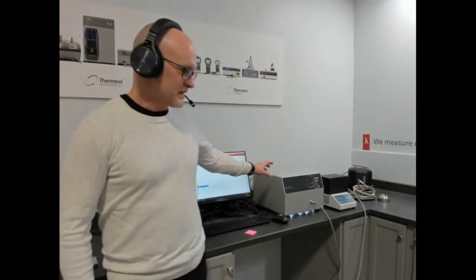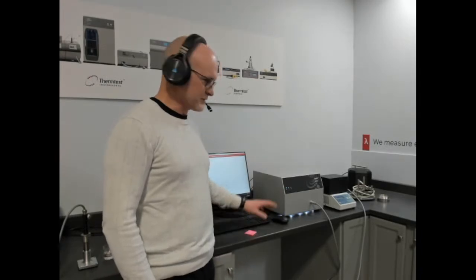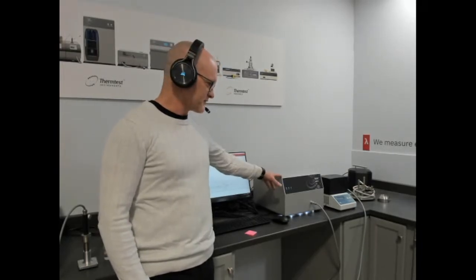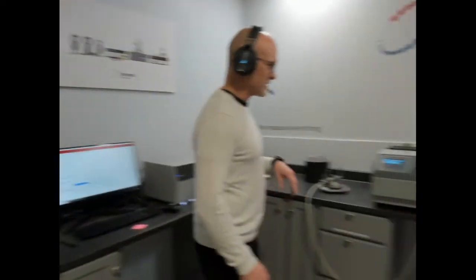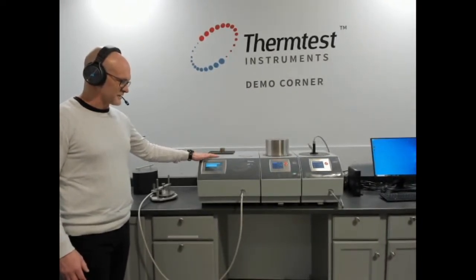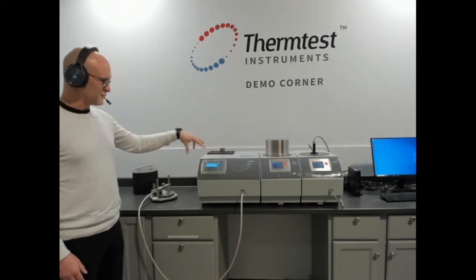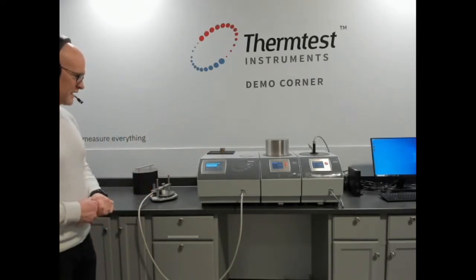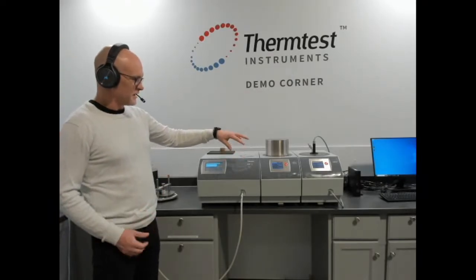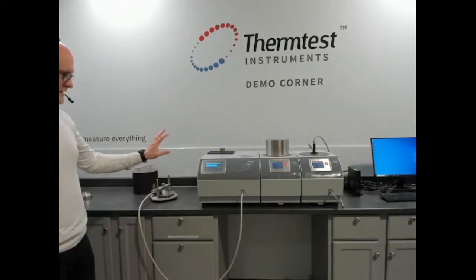Turning to my left is the new MPV, which we'll be talking more about next week. We're doing a demonstration series on that. The MPV standing for versatility, combining multiple methods for intelligent thermal conductivity. And then our marquee, the industry leader in transient versatility for measuring thermal conductivity, diffusivity, and specific heat across multiple methods. The MP1 being the highest level measurement platform we have, which combines the ability for multiple methods as well as a switch and intelligent software to connect those all together and increase volume and ease of measurement.